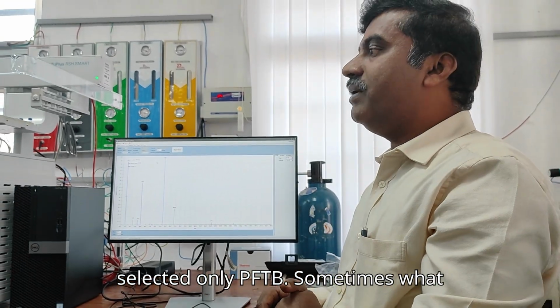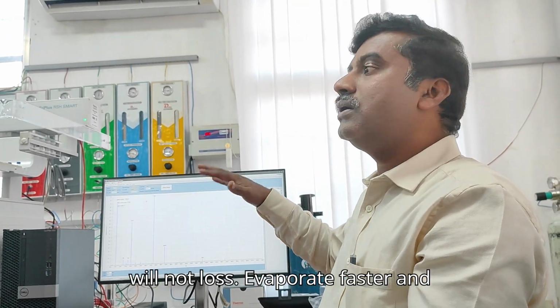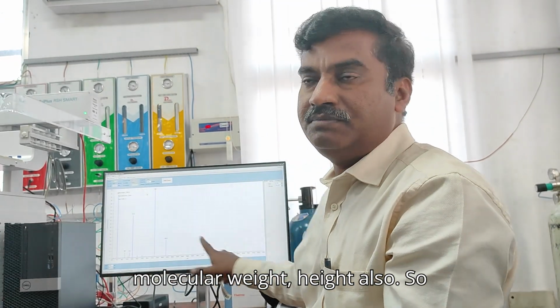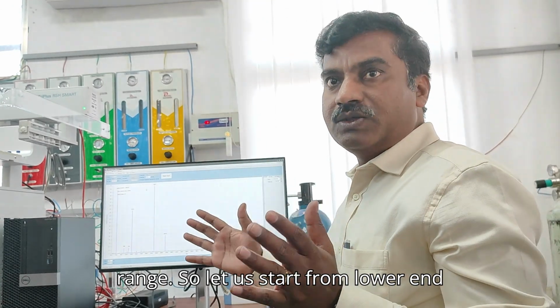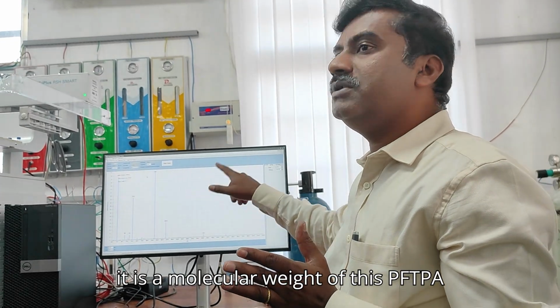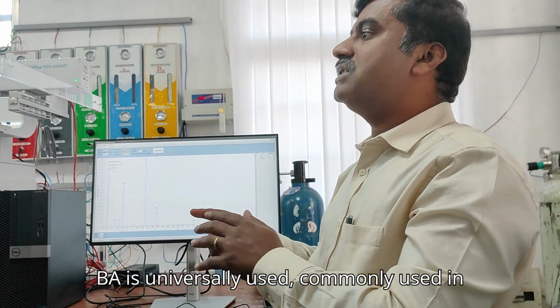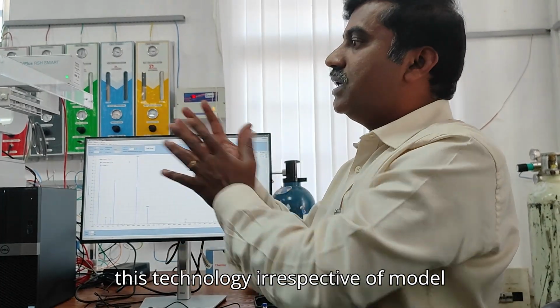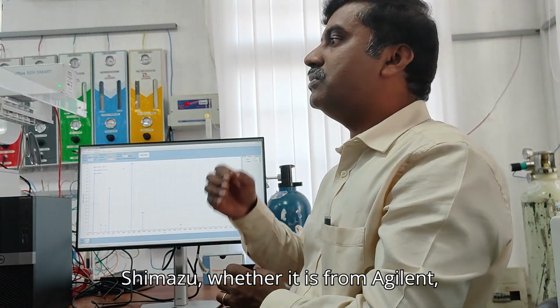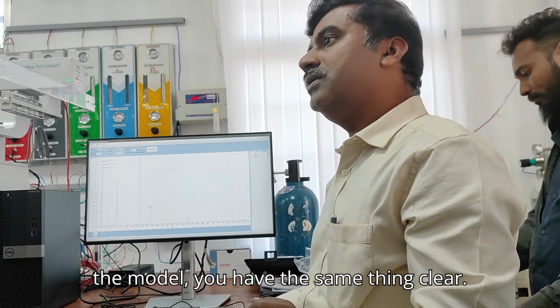Why is only PFTBA selected? PFTBA is a highly stable compound. It will not degrade, it will not evaporate faster, and more importantly, it covers the maximum molecular weight range. We work from lower masses to high masses, up to 600, 650, and the molecular weight of PFTBA is about 650, so it covers the entire mass range. That is why PFTBA is universally used in this technology, irrespective of model and vendor, whether Shimadzu, Agilent, PerkinElmer or Thermo Fisher. It is the same thing. Clear?